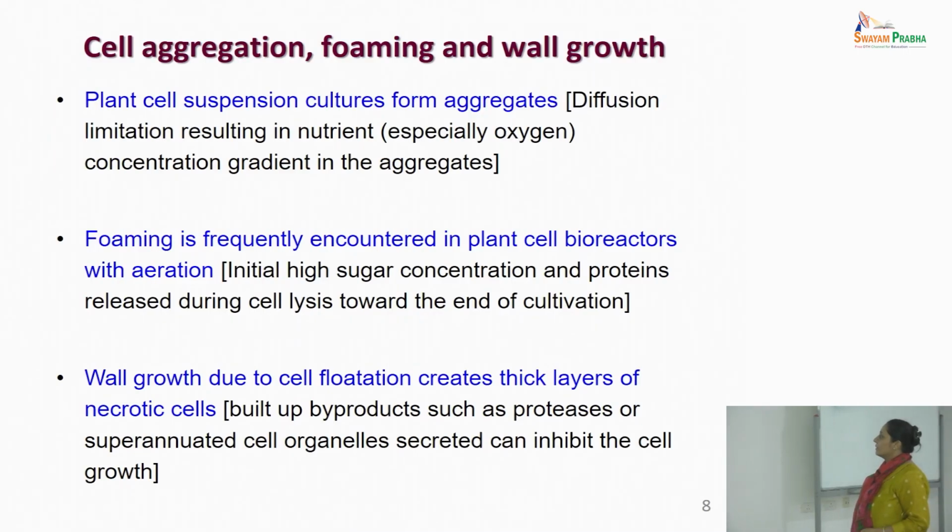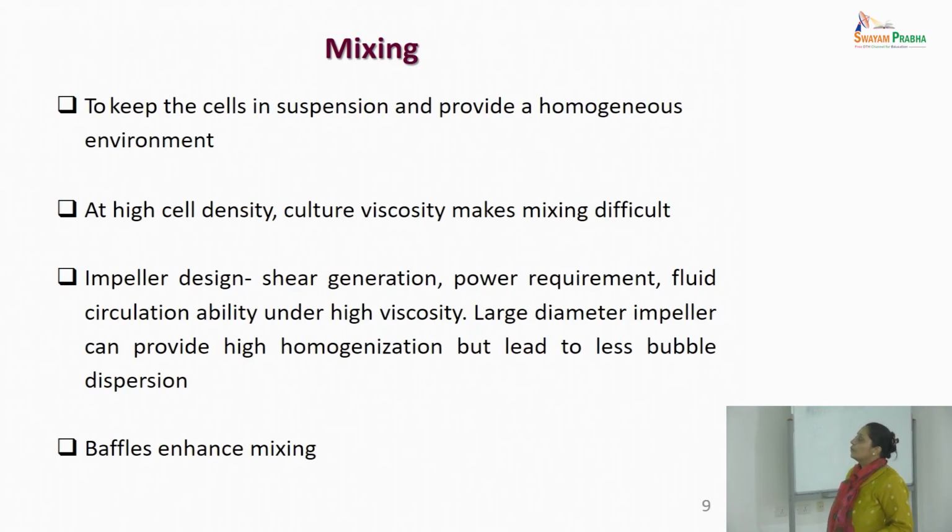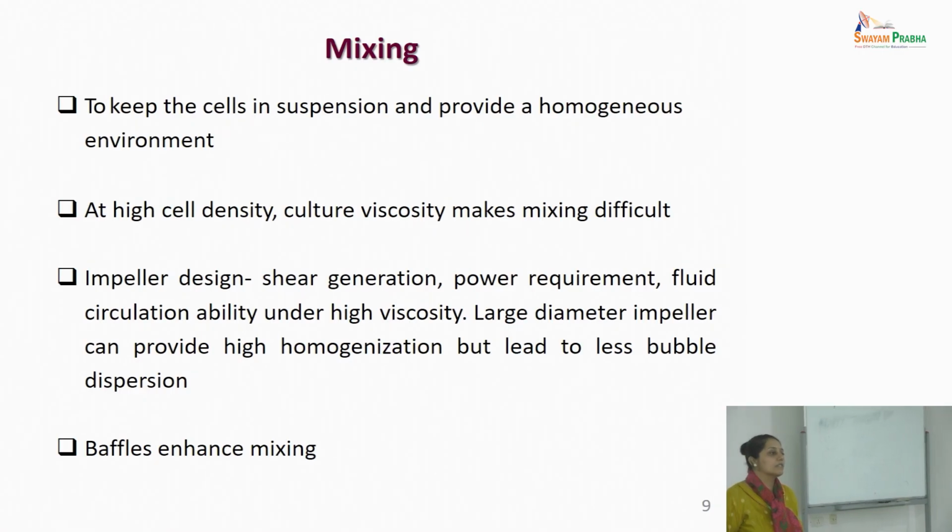Wall growth, I did tell you about this. So to keep the cells in suspension and to provide a homogeneous environment is the purpose of mixing, especially with plant cells, because they are high density, relatively in comparison to microbial cells.